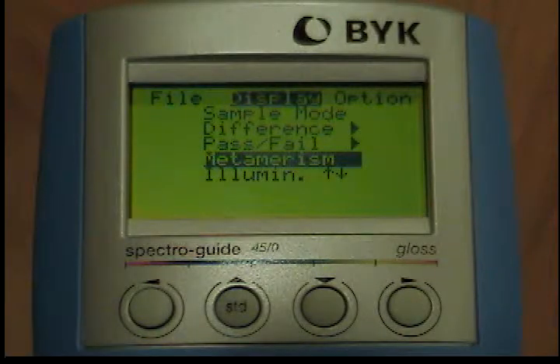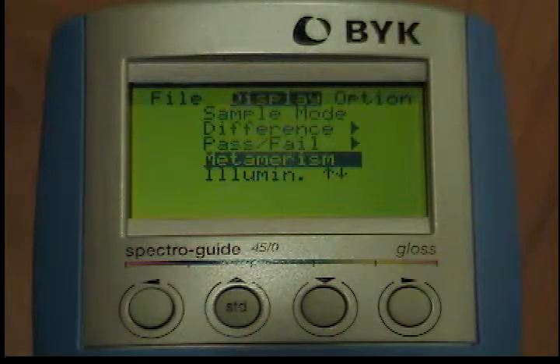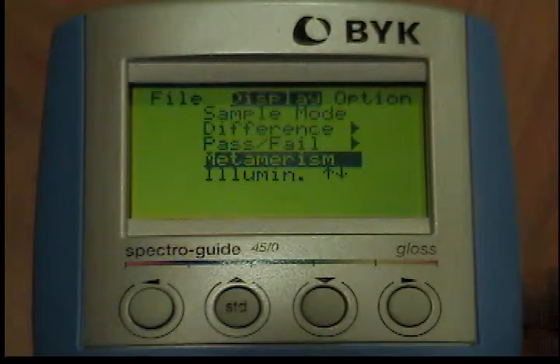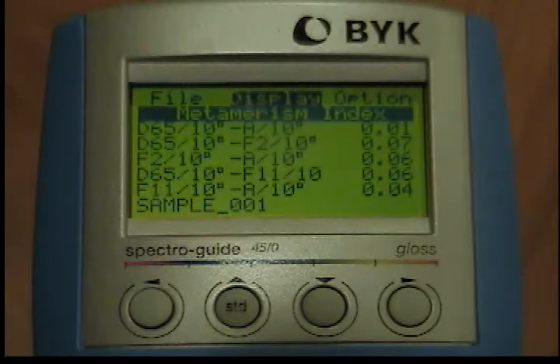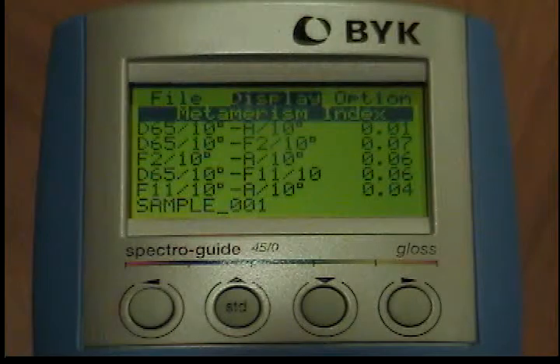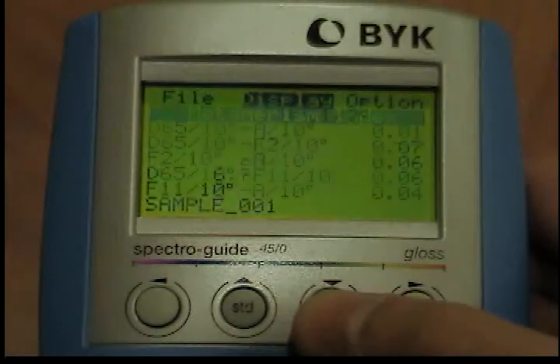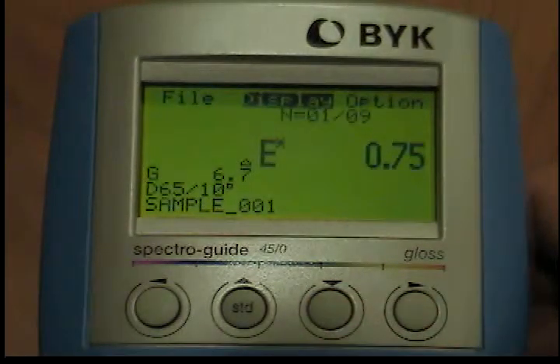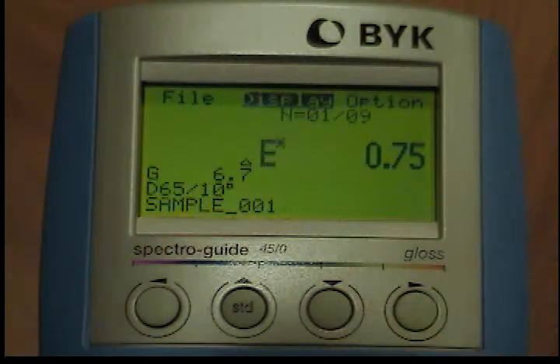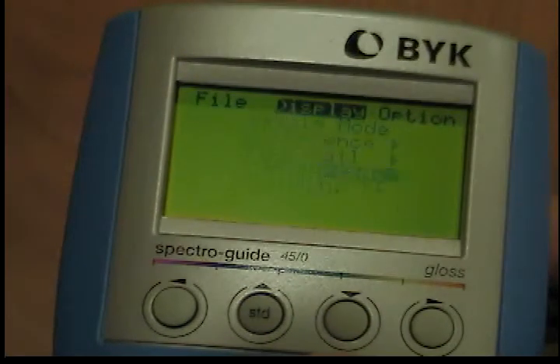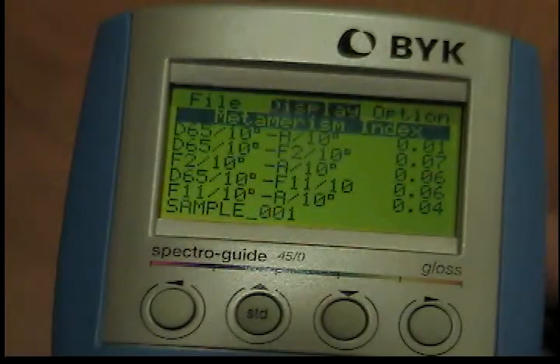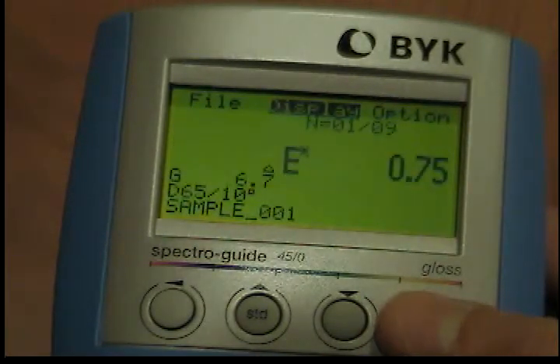To display the metamerism index for the individual types of illumination, use the down button to select the metamerism option in the display menu. When you press the operate button, the metamerism index for the various types of illumination will appear on the display. The display is determined by the selected illumination-observer combination. If illumination types D65, A, or F2 are selected, the display appears as shown in the accompanying illustration. If illumination type C is selected, D65 is replaced by C. If another fluorescent type, for example F7 or F11, is selected, F2 is changed accordingly.